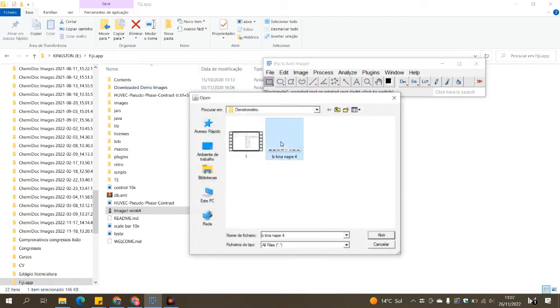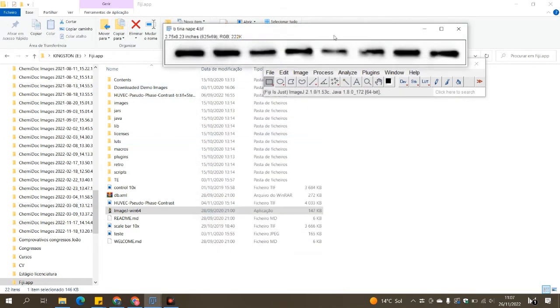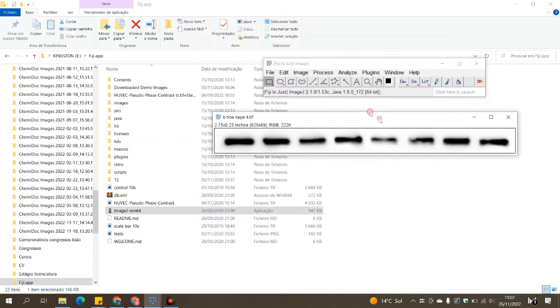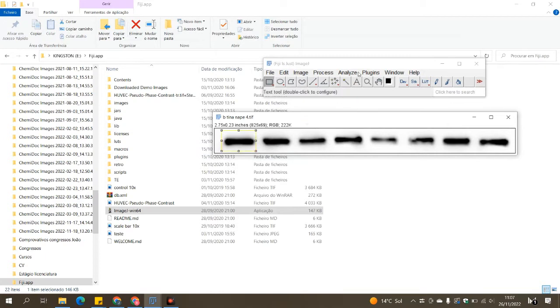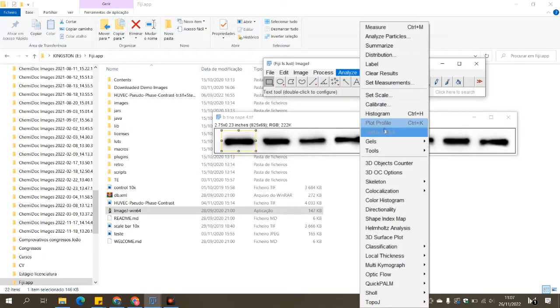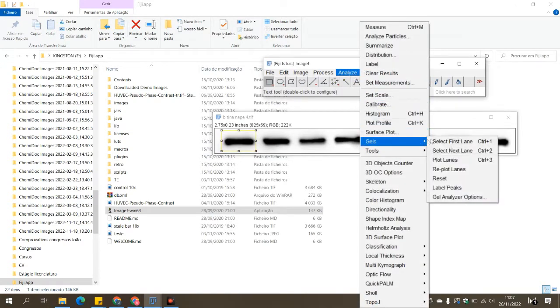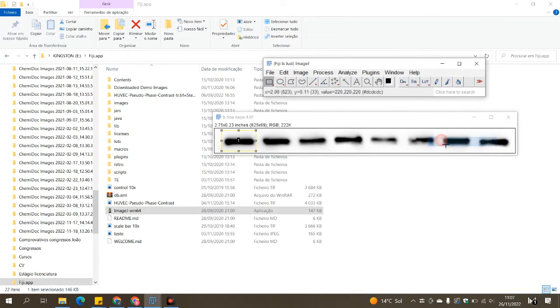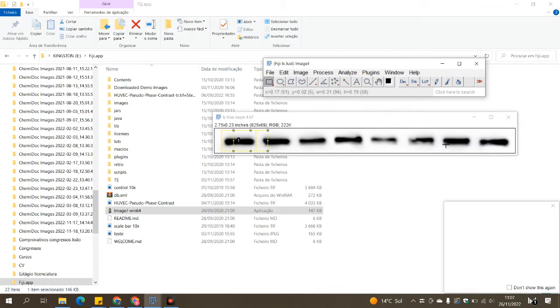The first thing you need to do is open your image of your western blot in ImageJ, then you select the square tool and select the band on the first lane.